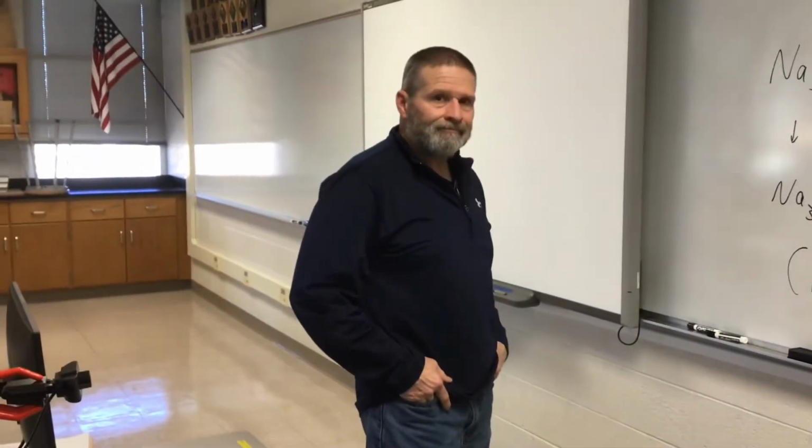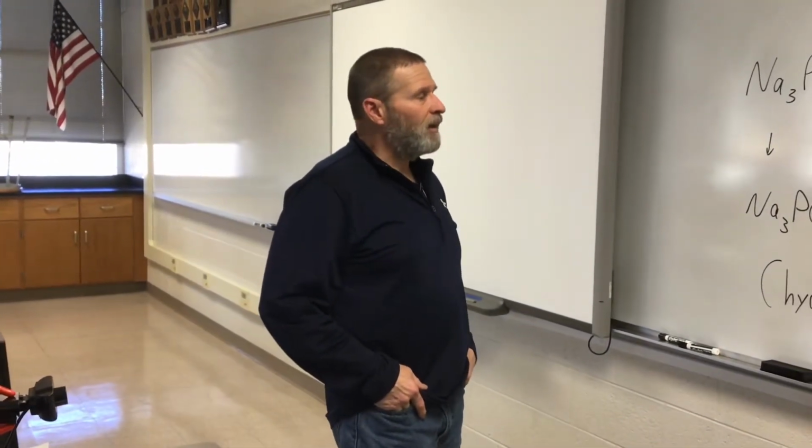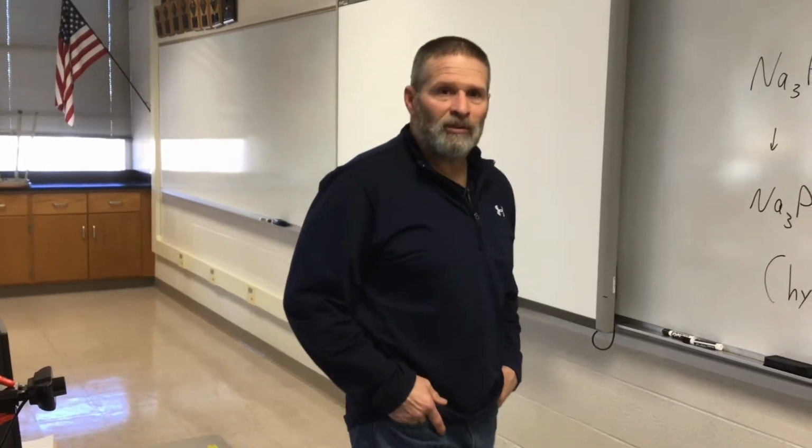So we have a final stoichiometry lab today. Yes, final stoich lab, and a little bit of limiting reagent for you, a little bit of everything in this one.